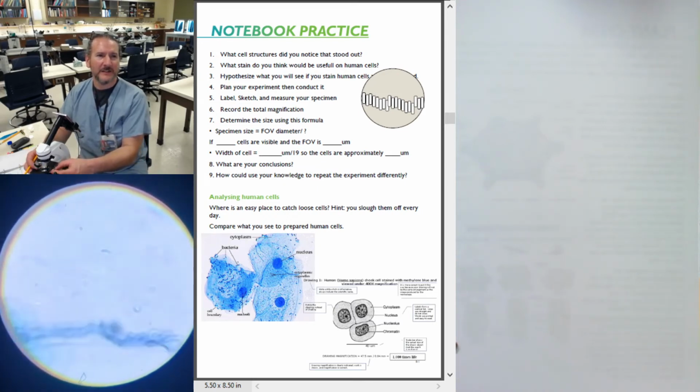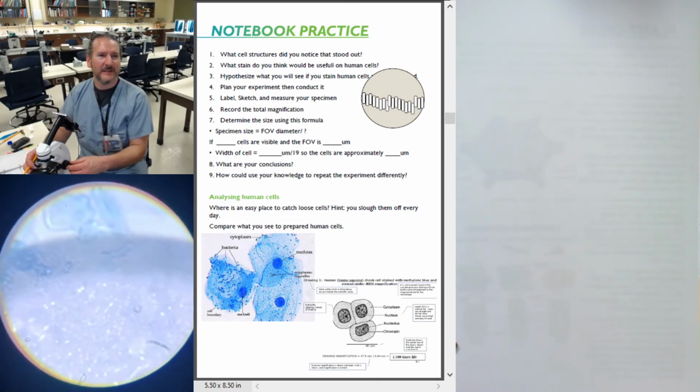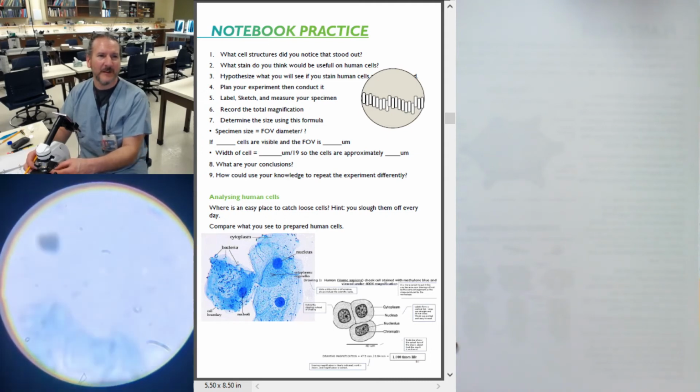Clump of cells. That's a big bubble. Huge. I can find some cells without the bubble. Looks so much like they're moving around, but they're not. I mean, not on their own, they're not.